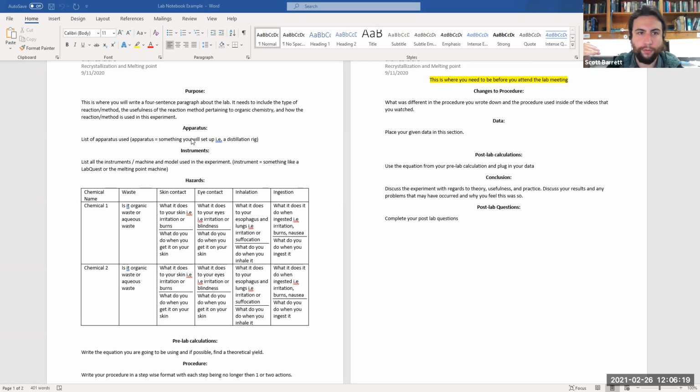And if you wanted to re-perform this experiment, just utilizing your lab notebook, you'd need to be able to walk in and say, okay, I need A, B, and C items in order to perform this, and A, B, and C apparatus in order to perform this experiment. And then I need this instrument in order to analyze the experiment that we perform with the given apparatus.